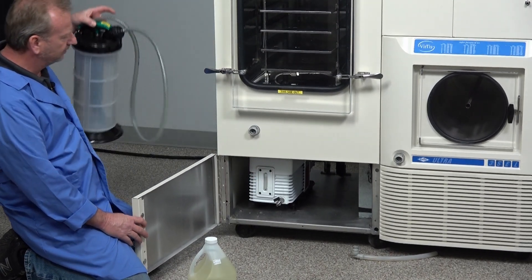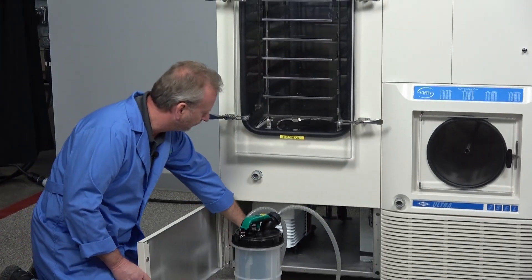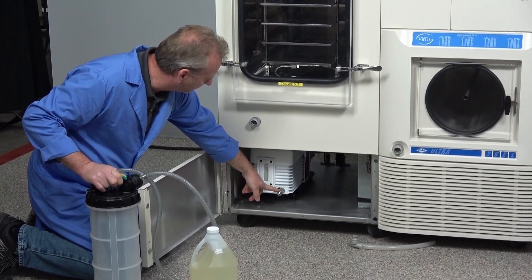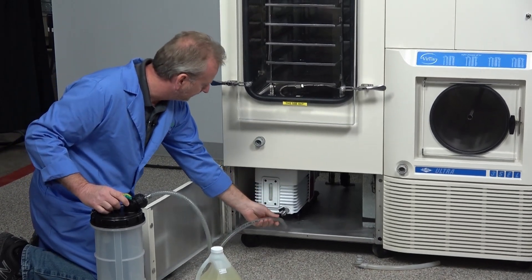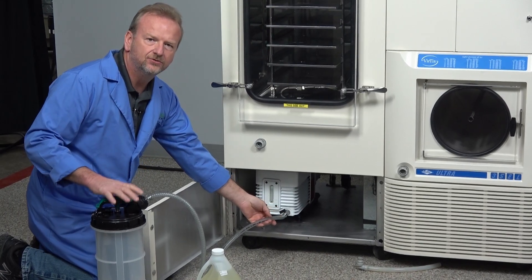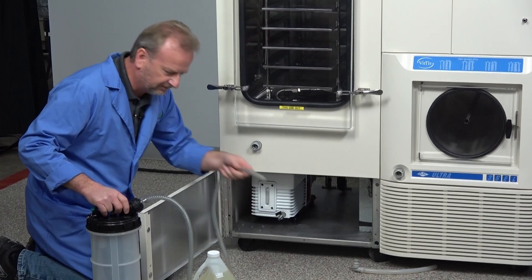We've also included an evacuation pump to change the oil with a quick change valve here, where you can simply plug your evacuation hose in, open the valve, and then just use the pump to evacuate your vacuum pump.